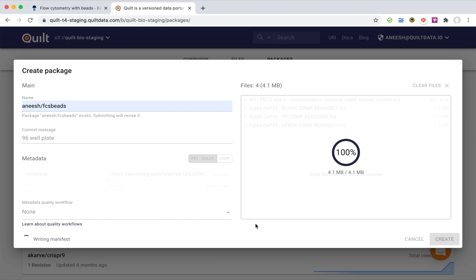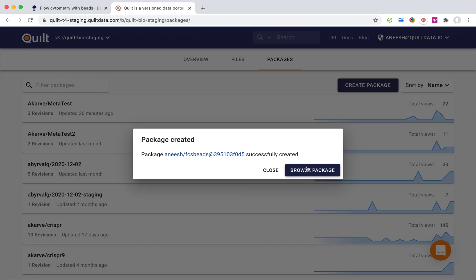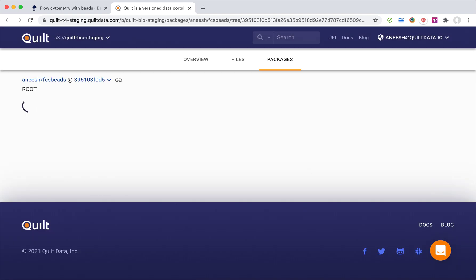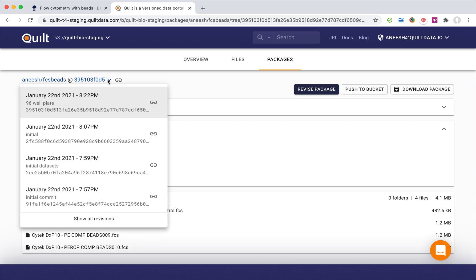It's transparently backed up into S3, and it's going to do something special for me. When I browse this data set or this package, the dataset itself now has a revision history, so I can see the transformations to the dataset over time and the commit messages that I made.